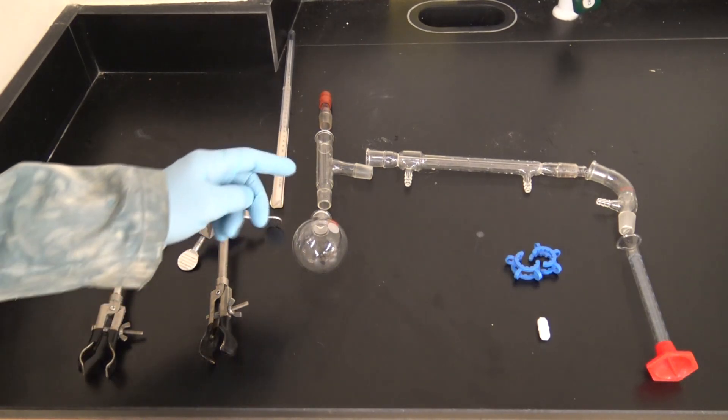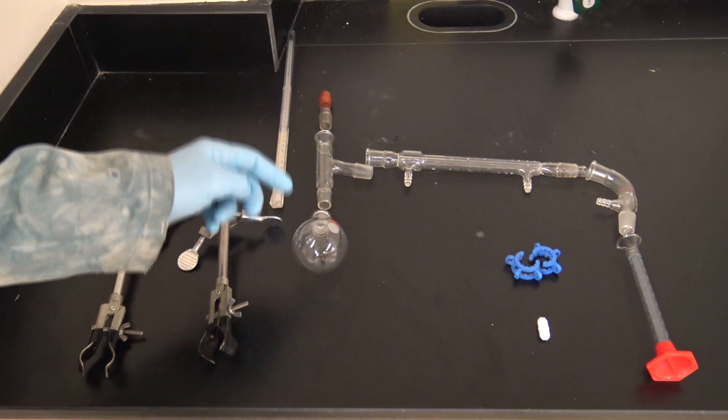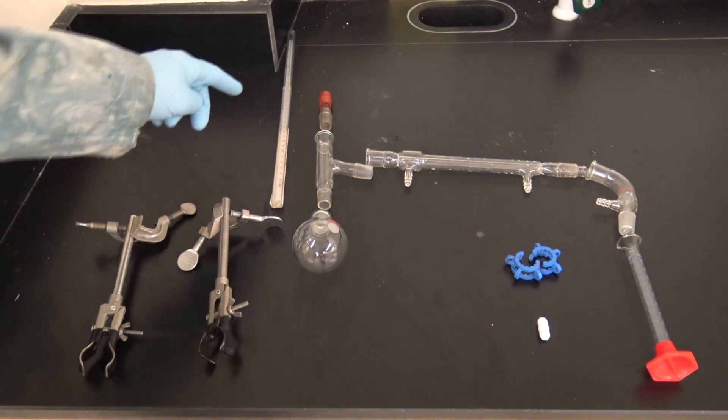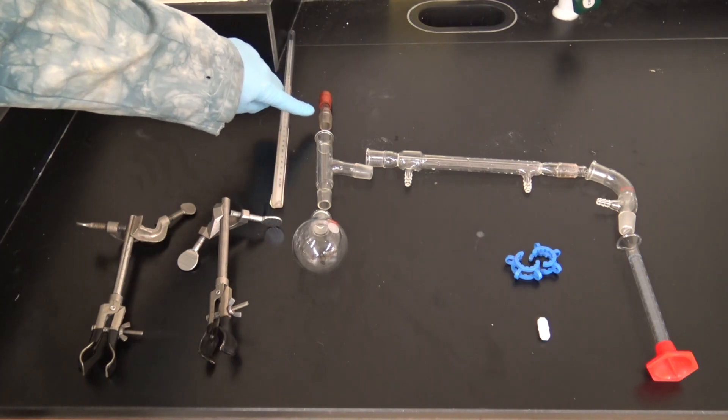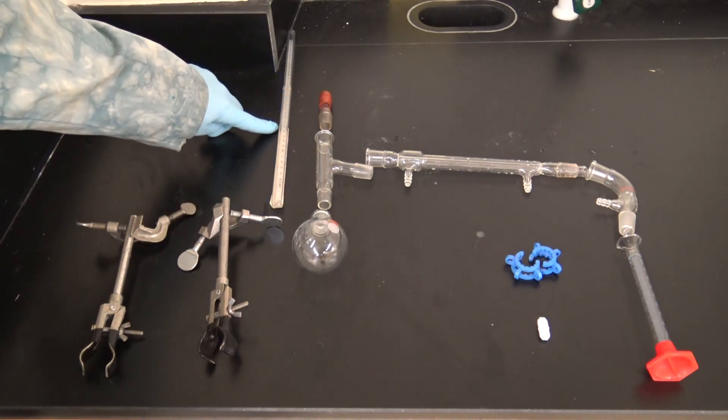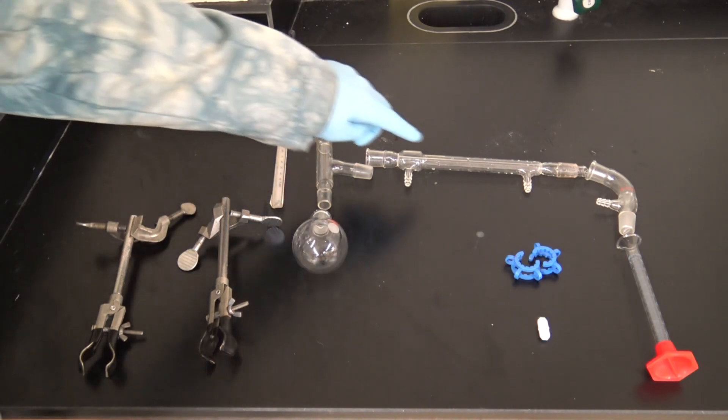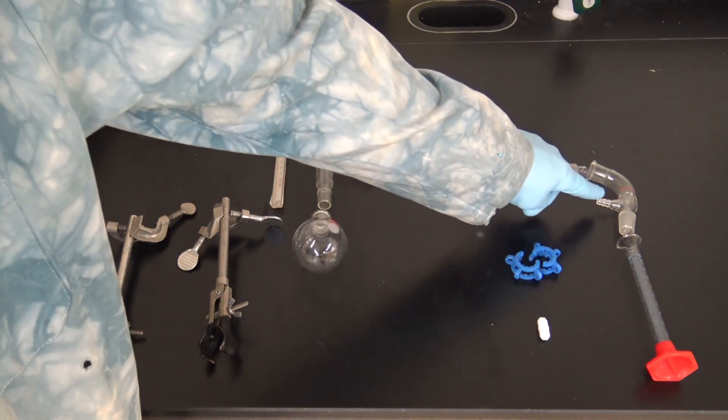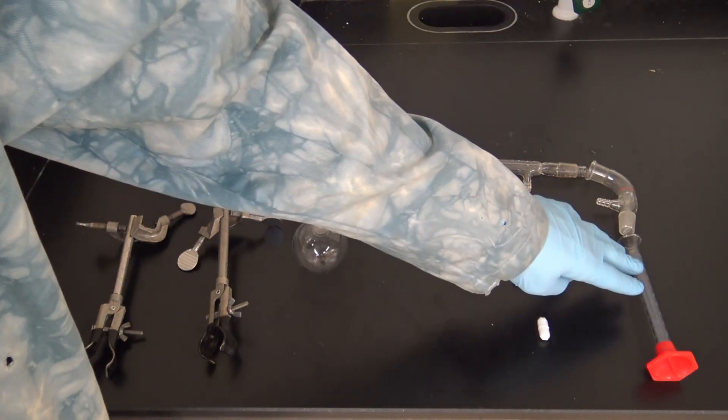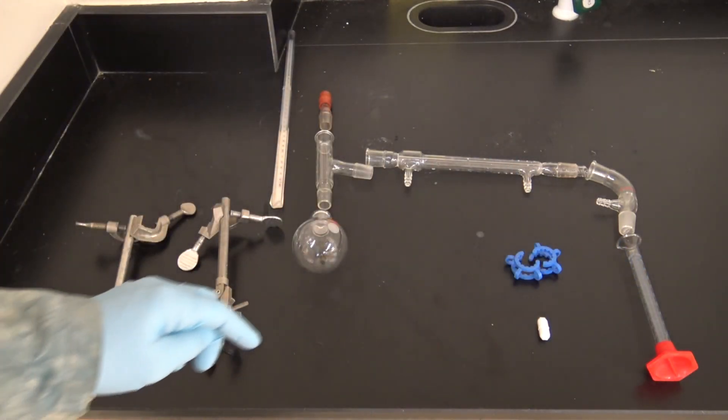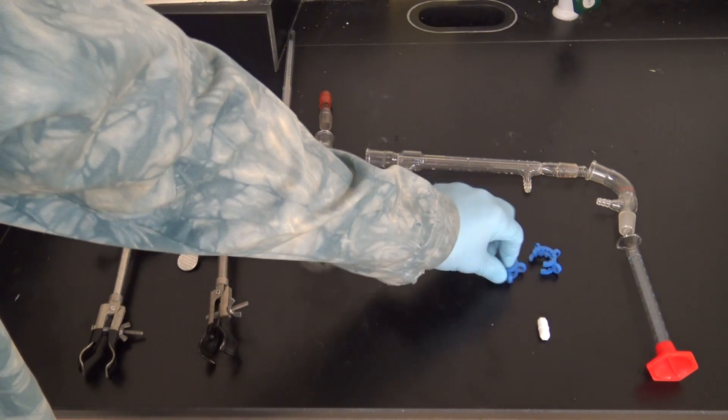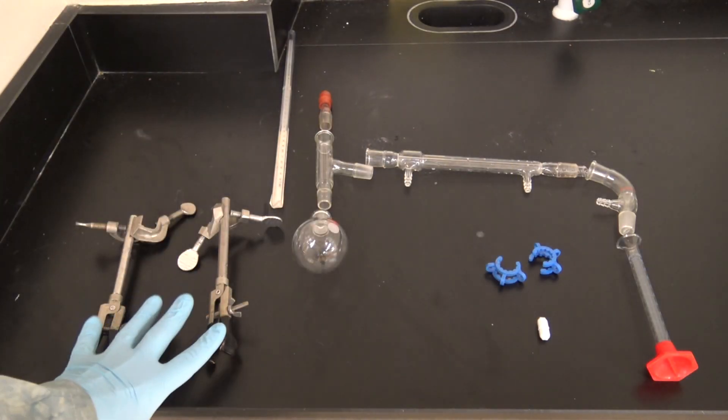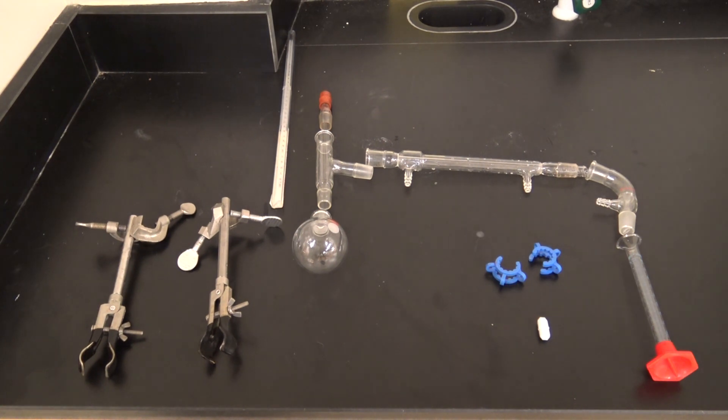Hey guys, we're going to build a simple still now. For that we're going to need a round bottom flask of appropriate size, a three-way connector to be our steelhead, a thermometer adapter and thermometer. To that we're going to connect a West condenser, a vacuum adapter that's going to direct flow down into a 10 ml graduated cylinder, and of course we're going to have some connectors and a spin bar and some other clamps to keep things in place.